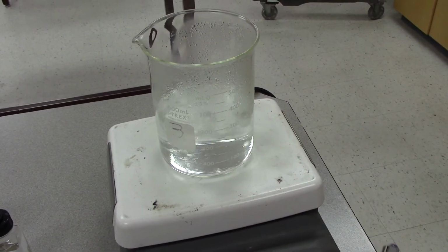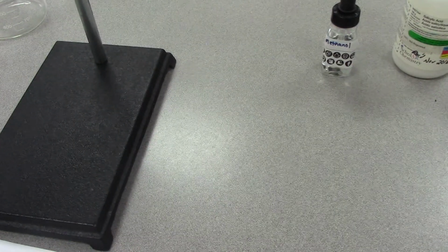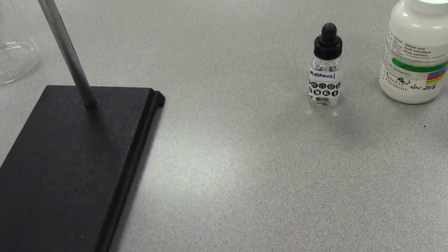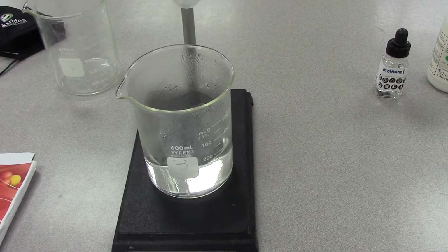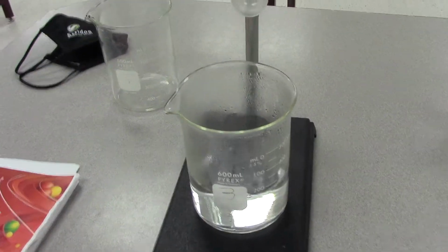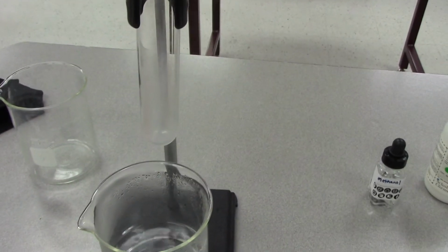All right, here's my esterification reaction setup. The first thing I need is a hot water bath. It's not a hot water plate, a hot water bath. So I'm going to heat that. I've heated that up on the hot plate, and I might warm that up again. The test tube is going to sit in the hot water bath.